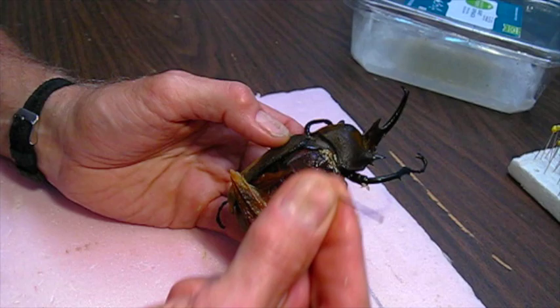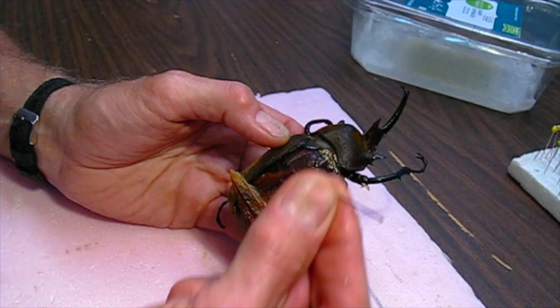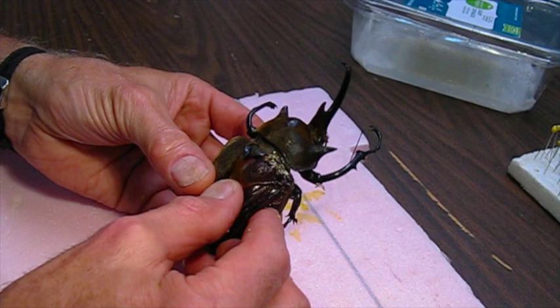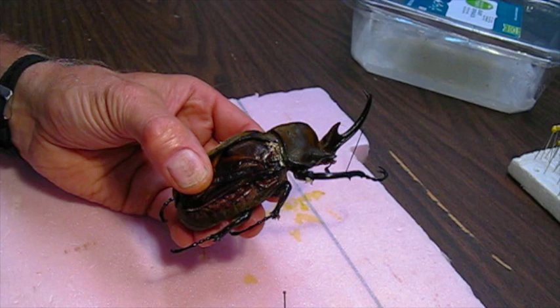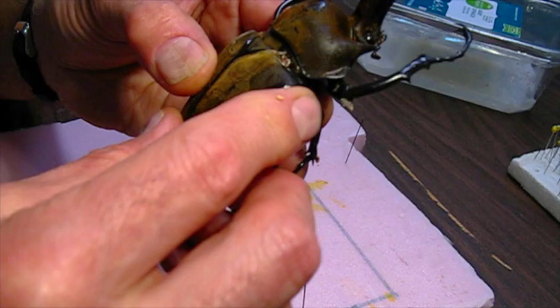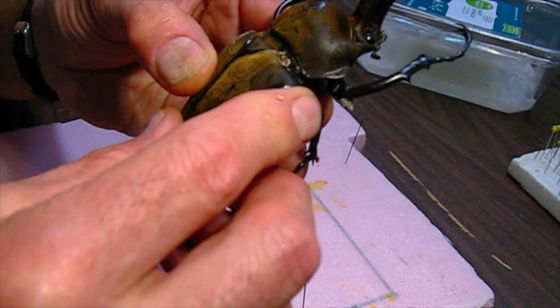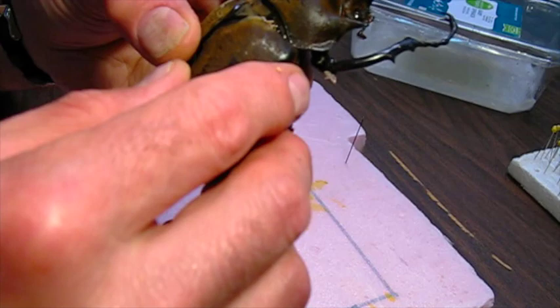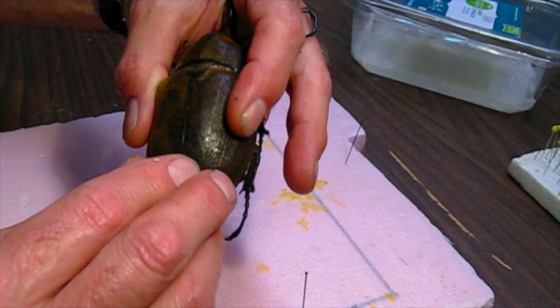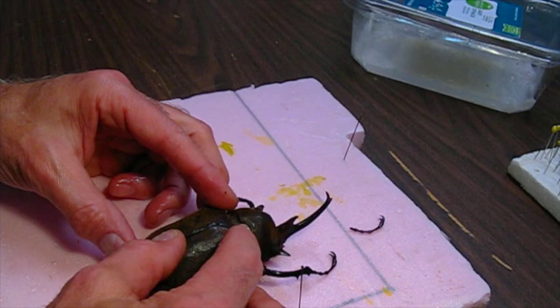With such a big beetle you're going to need a large pin — this is a number nine pin, pretty large — and it should be long enough to fit all the way through that body. It goes through the right wing cover; that's the classic way to pin them. I've got to get this all in position before I put the pin in to make sure it's all lined up properly. This wing cover should fit over here. Since the wing cover is loose, the pin will hold it in place and I probably won't have to glue it.